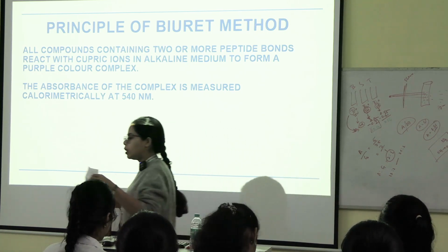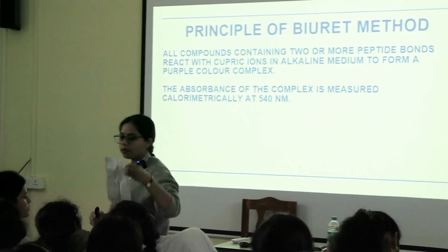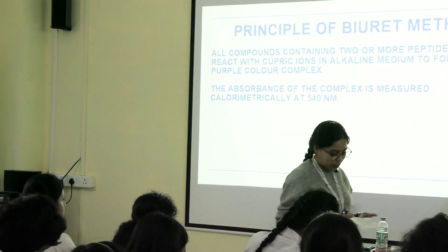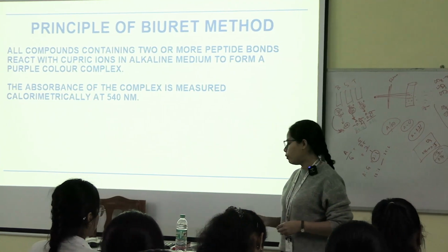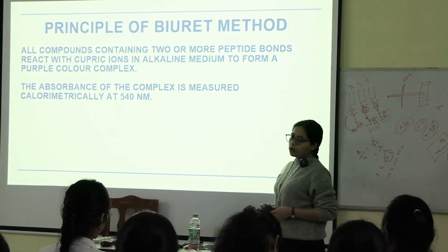Can you see 550 over here? Yes. But the colorimeter that we are using doesn't have 550, so we'll measure it at 540.